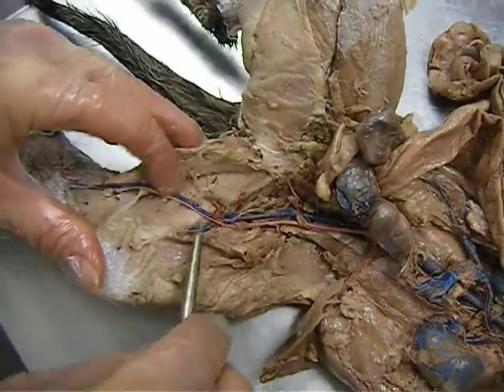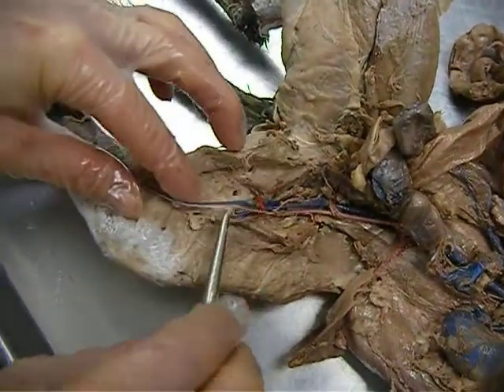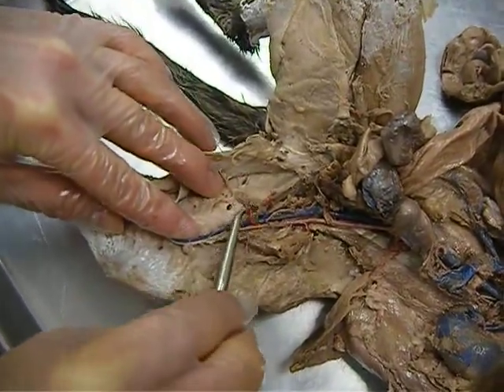Going to the knee is articular. The stretchy one is saphenous. And this going to the muscle is muscular.